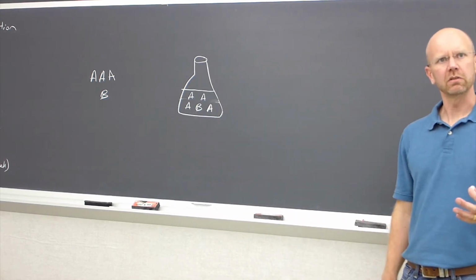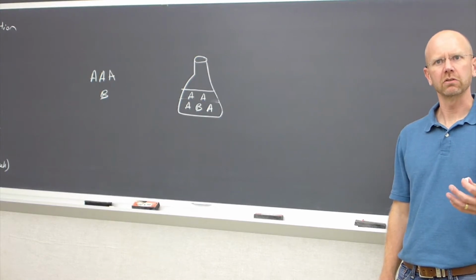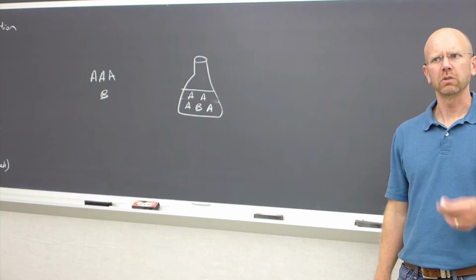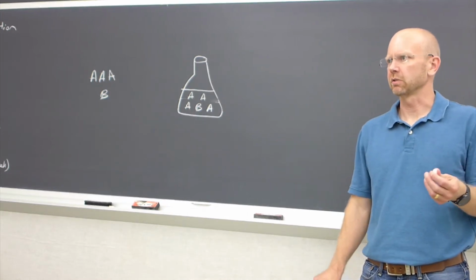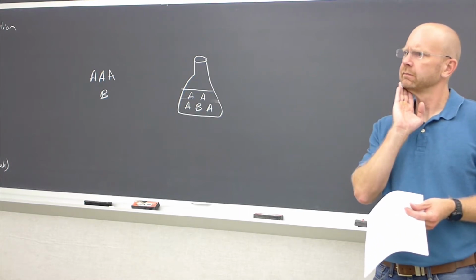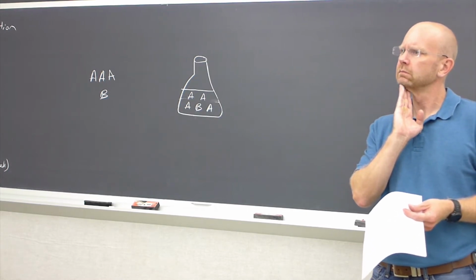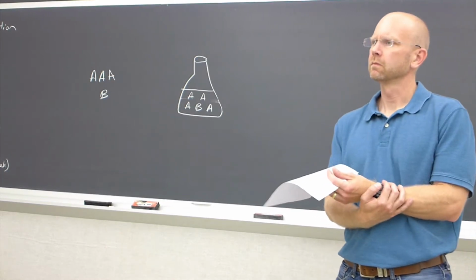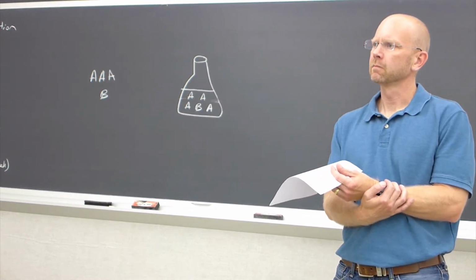What does it mean to be a saturated solution or a supersaturated solution? How do you get a solution of that kind? What do you have to do? You have to heat it. Yeah, so why do you heat it? So that the interactions of the solvent and the solute are maximized, I guess?